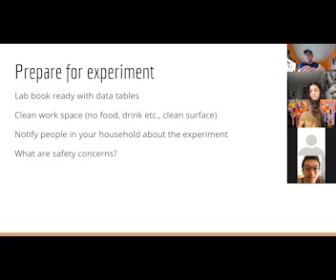So when we deal with something dangerous, any kind of chemical, I don't even care what it is, if it's salt, you should have eye protection on, okay?